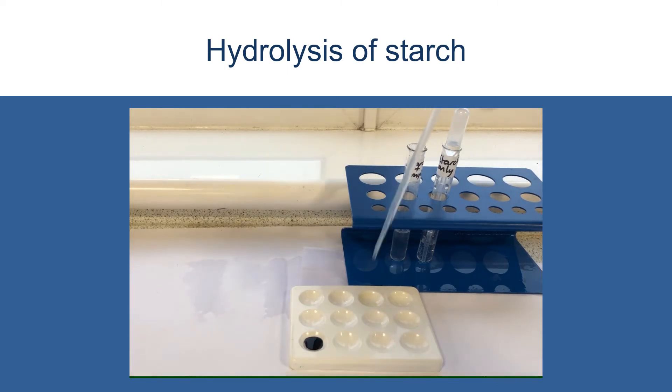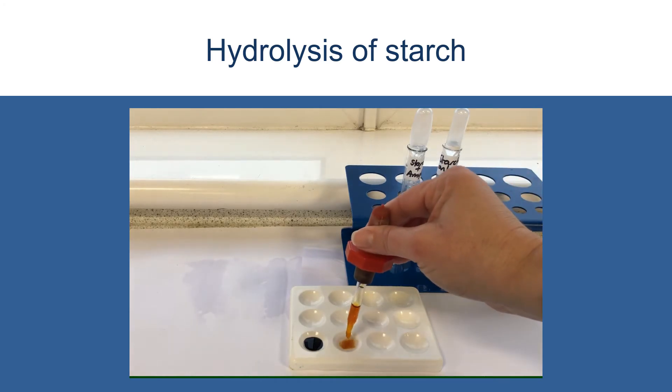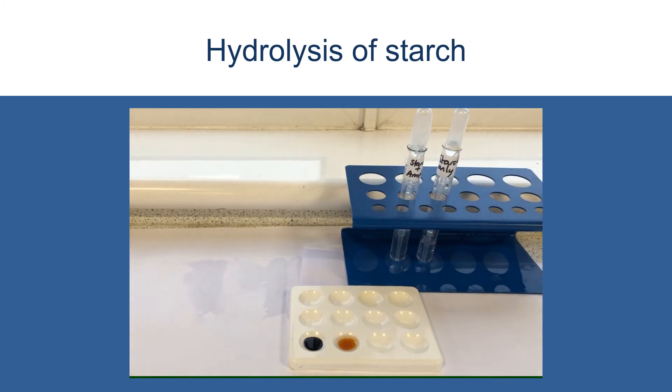This is the starch that had the enzyme added to it. So put a little bit of that in there and add a few drops of iodine solution. And what you'll see is that we are now no longer getting that blue-black colour change. So that indicates there's definitely been a change with the starch.